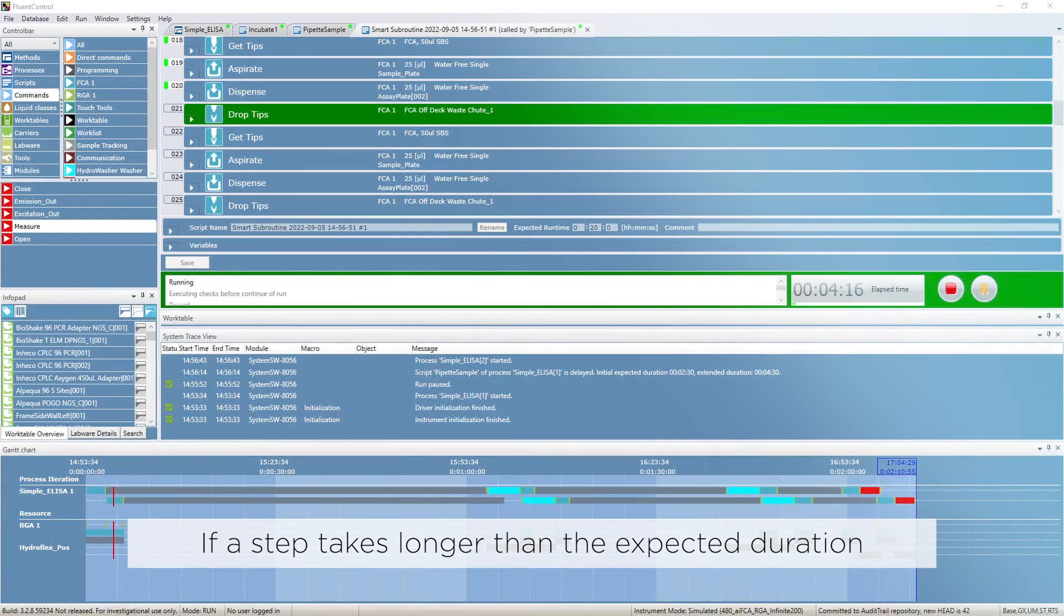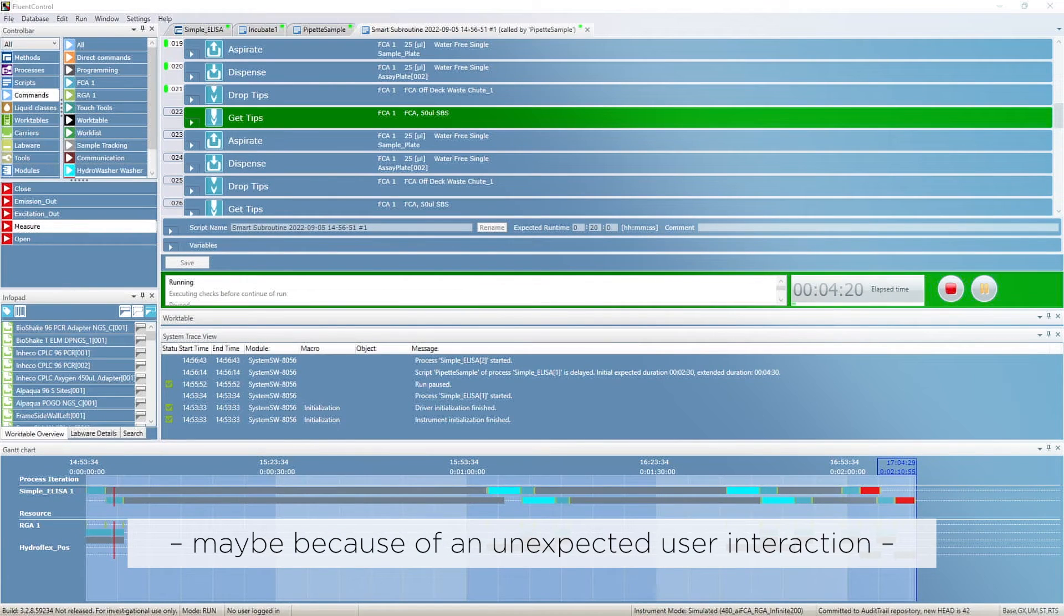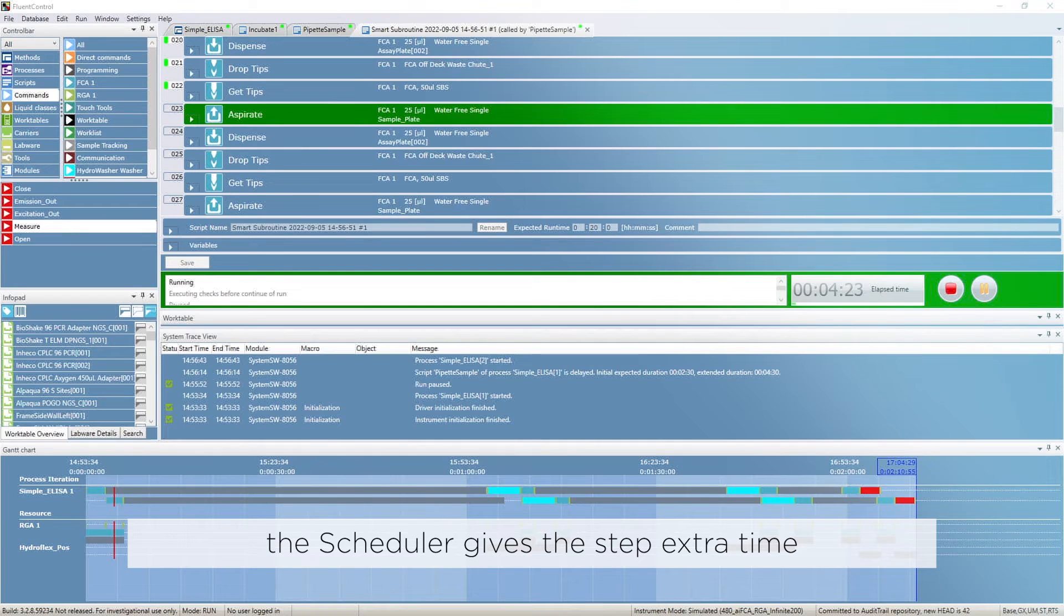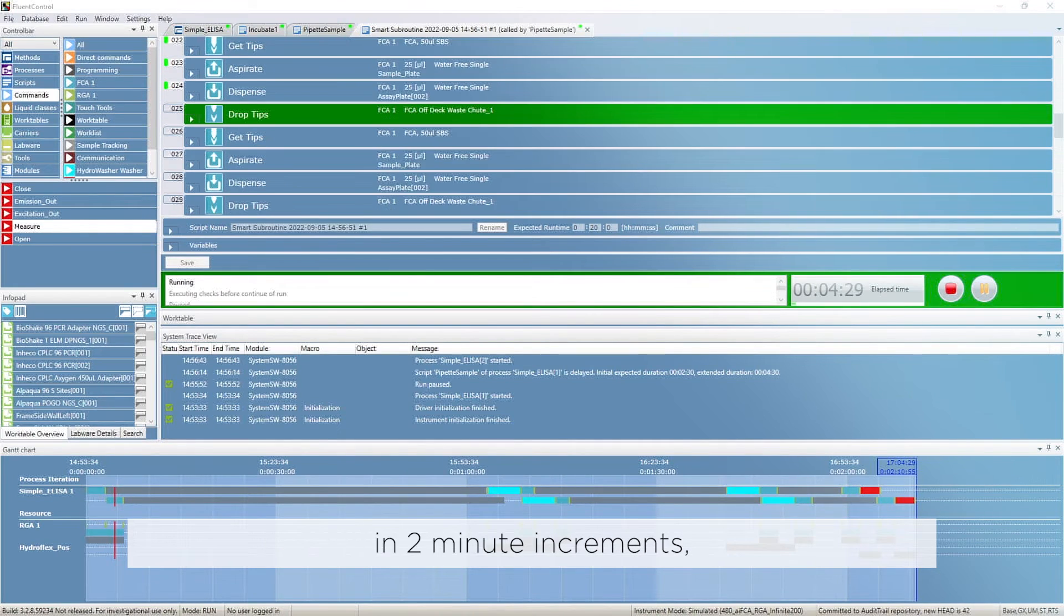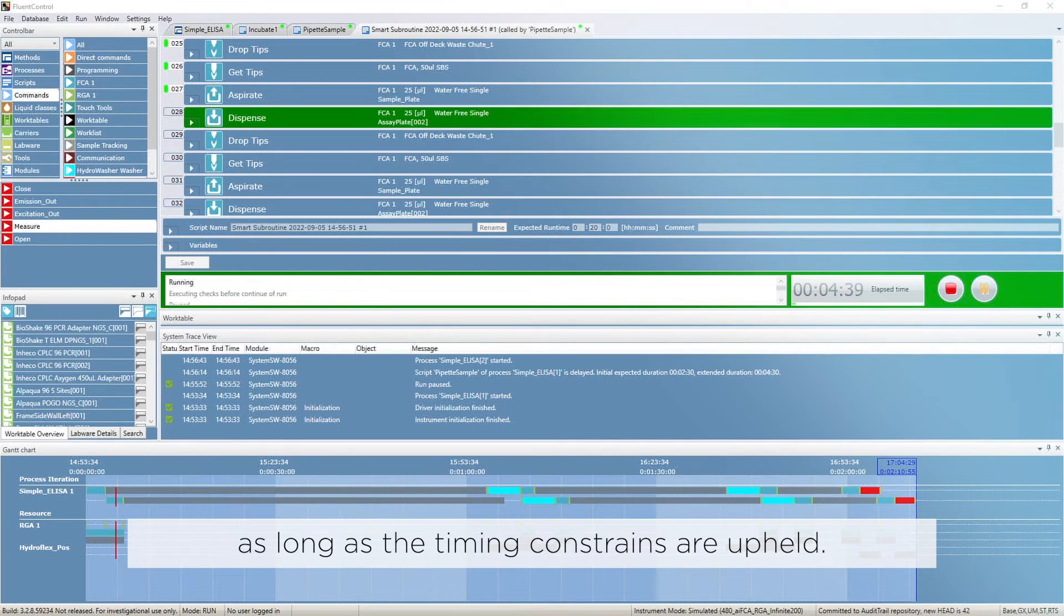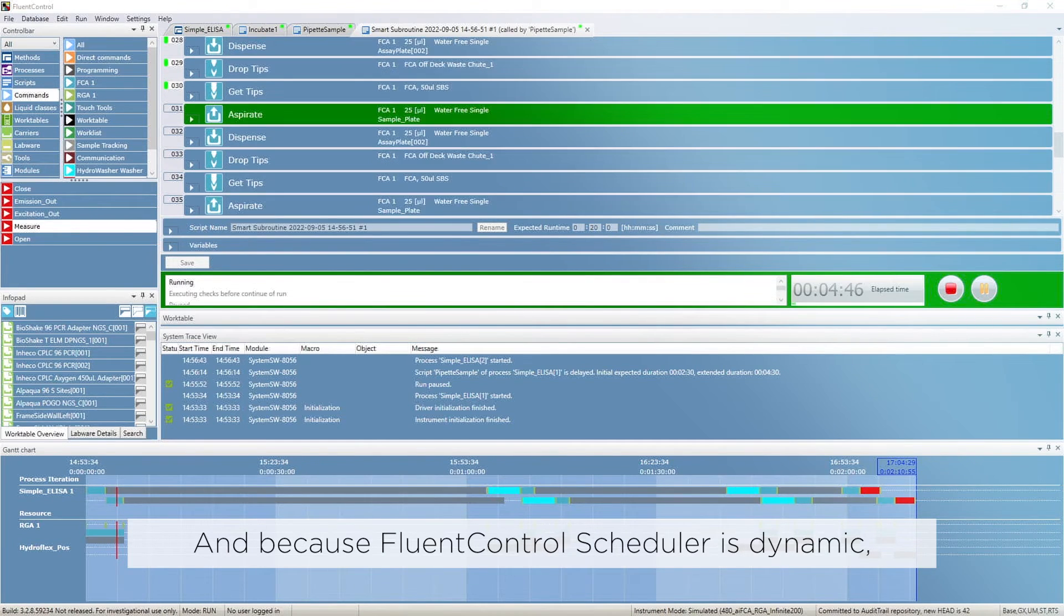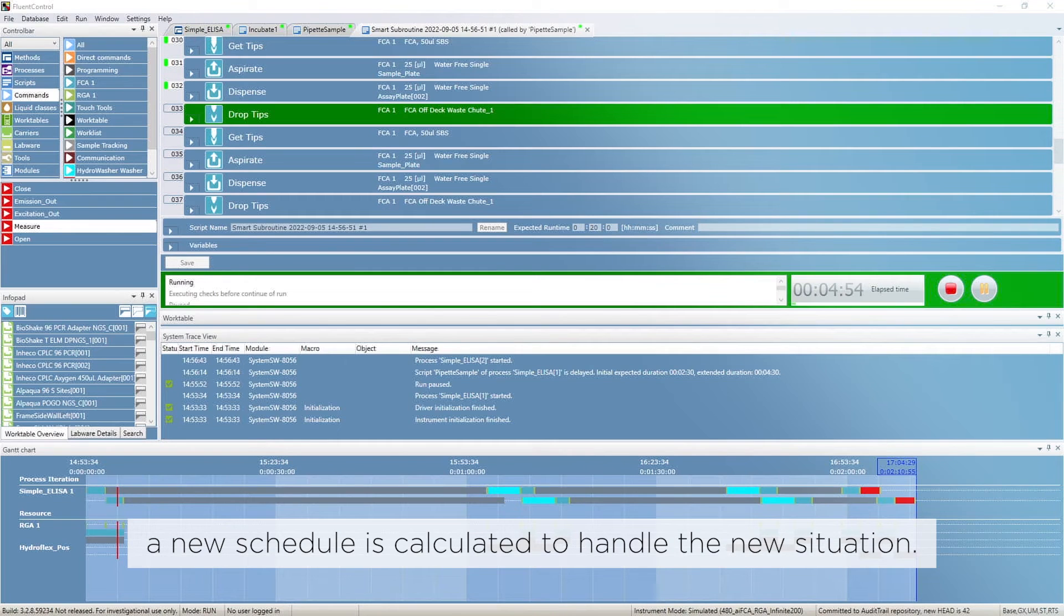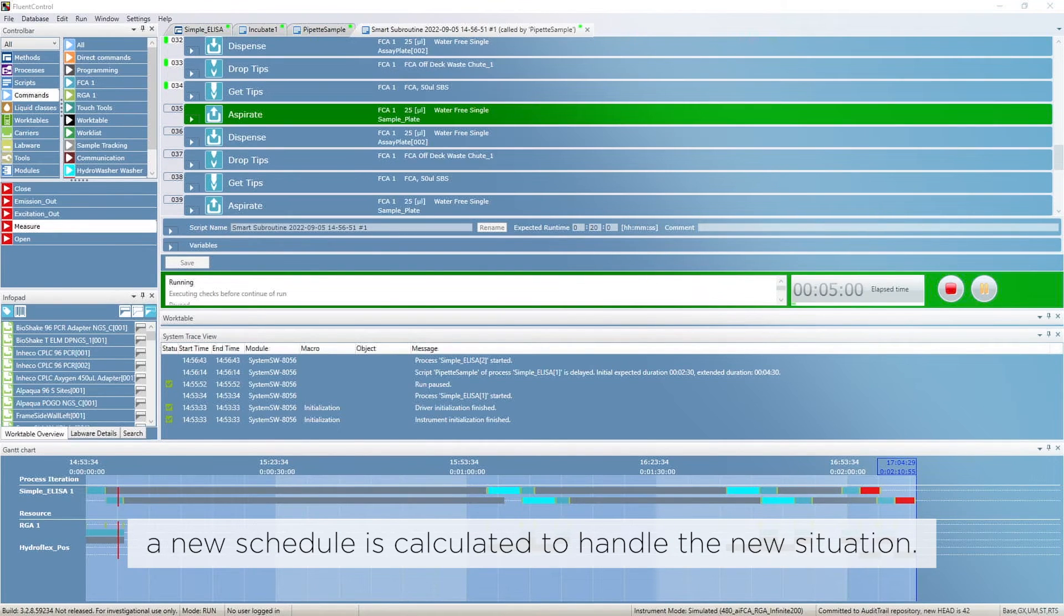If a step takes longer than the expected duration, maybe because of an unexpected user interaction, the scheduler gives the step extra time in two minute increments as long as the timing constraints are upheld. And because FluentControl scheduler is dynamic, a new schedule is calculated to handle the new situation.